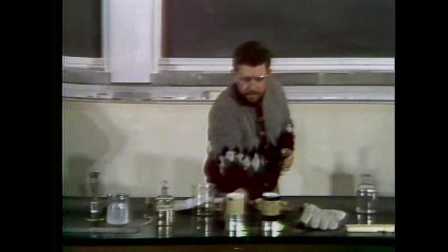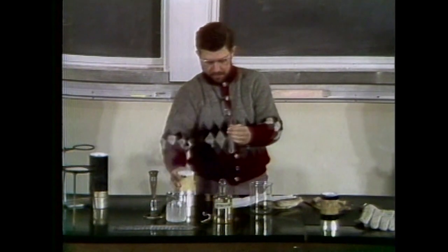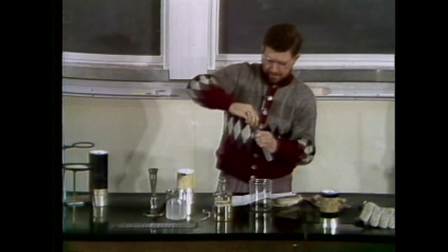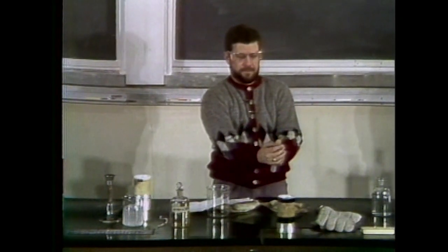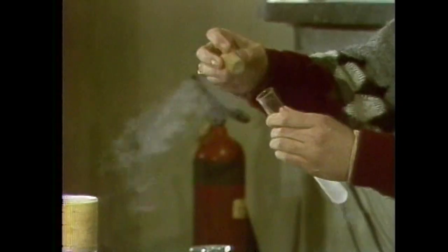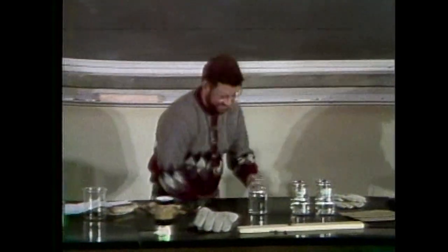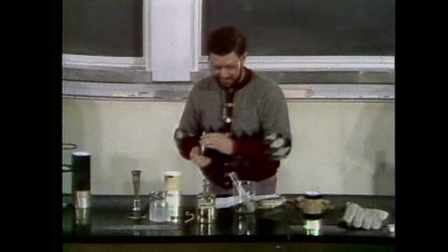I'll show you. You take a little liquid nitrogen like so, put it in a test tube, and have a little cannon. Fire one. Ready? Stand by. Let's hit this side, making too much noise. Feeble.